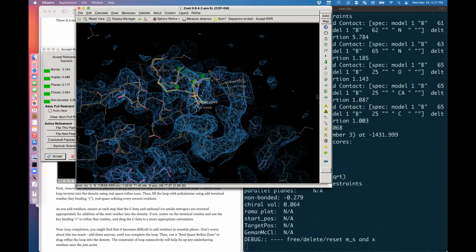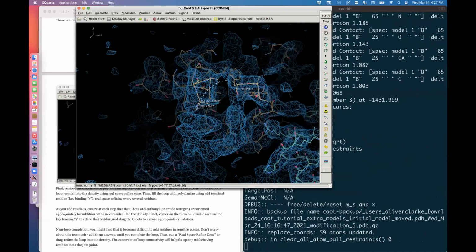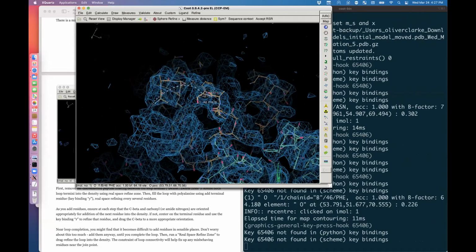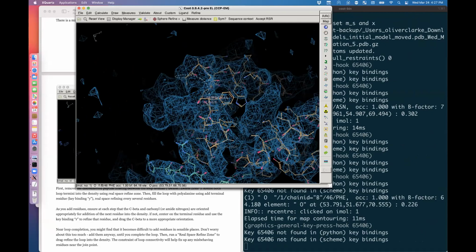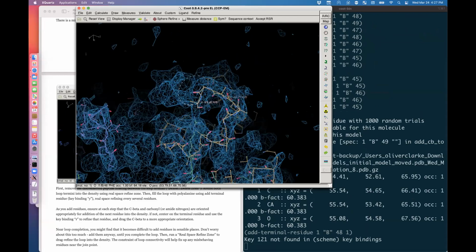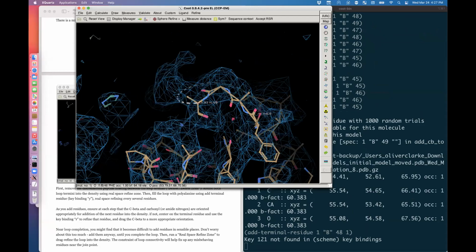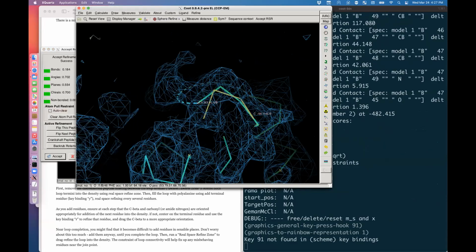And now we're going to want to add polyalanine in here, and I'm going to use the Y shortcut to do that, which was just a shortcut for simply adding a terminal residue. So I'm going to keep going through, just rotating around and monitoring it as we go. And you can see that here it's gone the wrong direction. This one should be heading over there. It's put the C beta where the continuation of the chain should go.